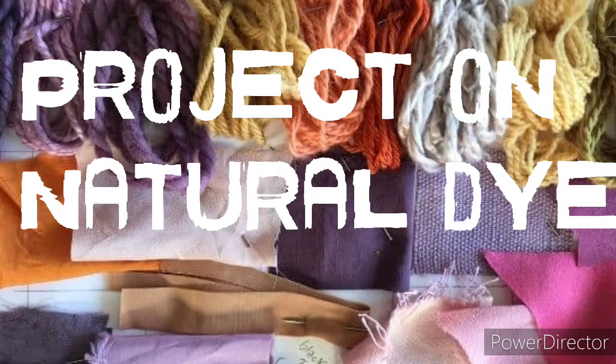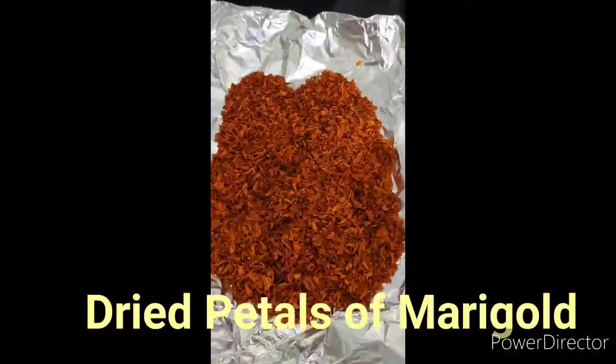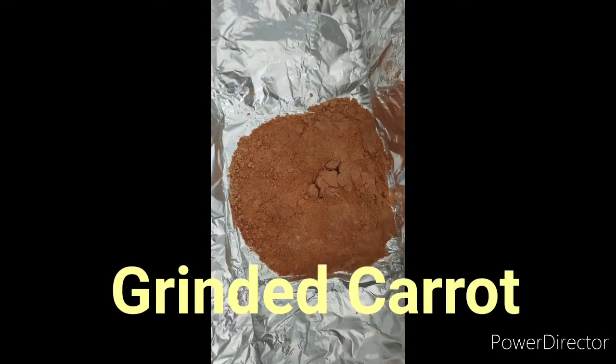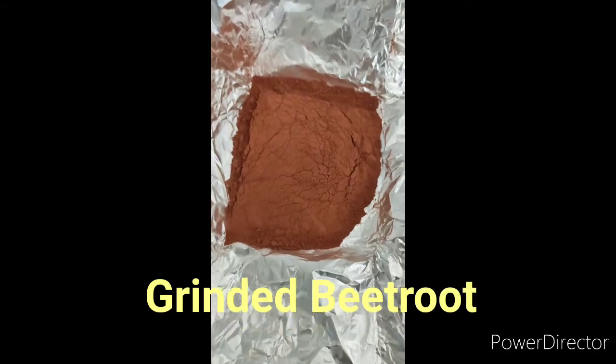Here we present our project on natural dyes using natural raw products. Here are some images of our dried petals of marigold, followed by the grinded petals of marigold, followed by the grinded sample of carrot and the grinded sample of beetroot.